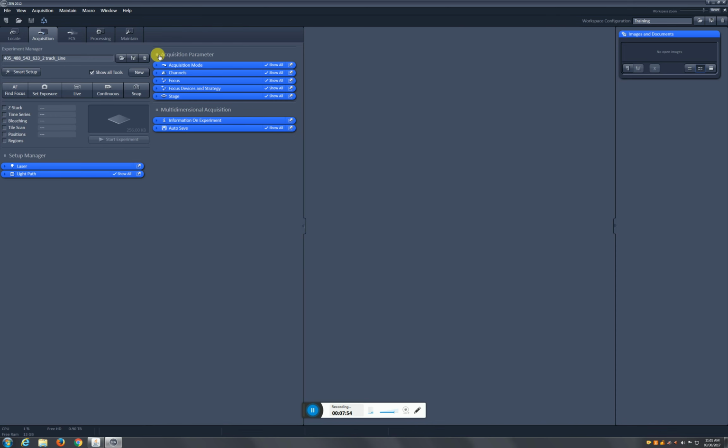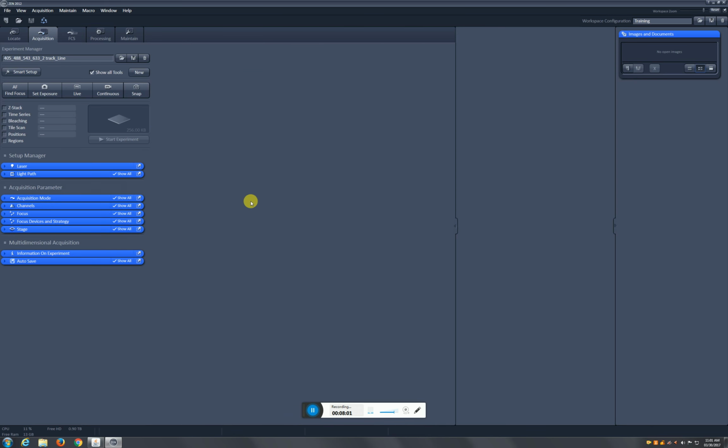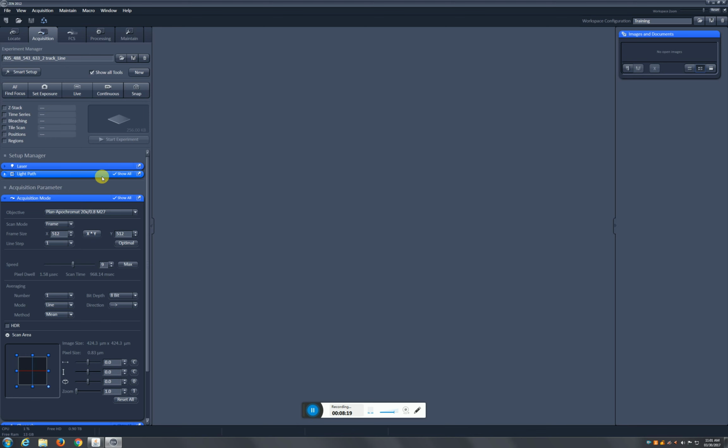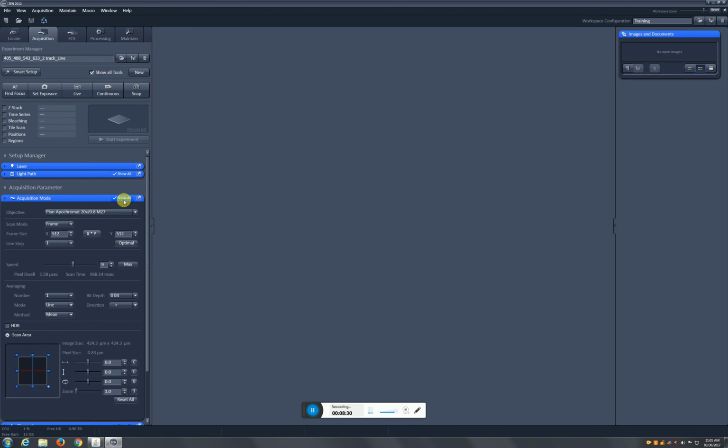You can also click and drag groups of these boxes and put them in different spots, which I'm going to do for the sake of this video so you guys will be able to see the sample. So I put everything on the left side here. Also, you notice that a lot of these windows have these little show all checkboxes. By default, the software is only going to show you what it thinks is absolutely necessary to get your imaging done, and it may hide some details from you, but if you ever want to see more information, just click the show all button and you can see that.